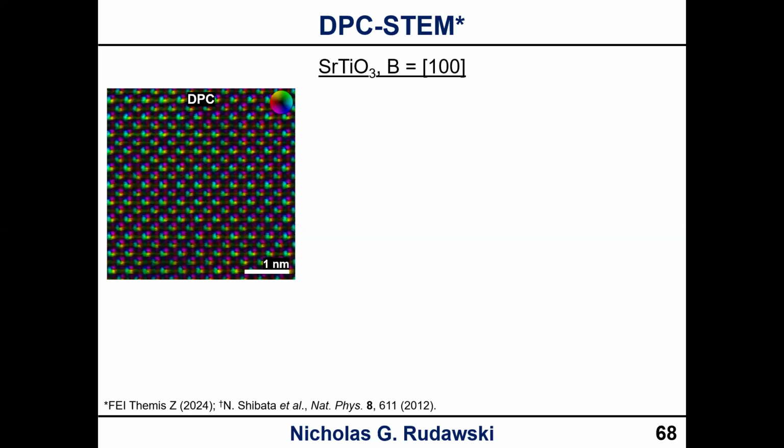In other words, peak red and peak green and peak blue all have the same magnitude of the vector. The only difference is the orientation. The orientation is dictated by where the color sits on the color wheel. Based on the color wheel legend in the upper right, red would be pointing straight to the left, cyan would be pointing straight to the right, green would be pointing at about a 60-degree angle counterclockwise from the right, and blue would be pointing at about a 60-degree angle clockwise from the right. Hopefully that makes sense.